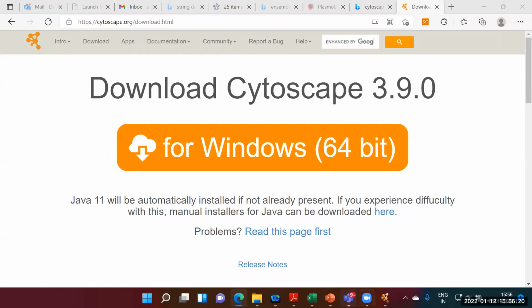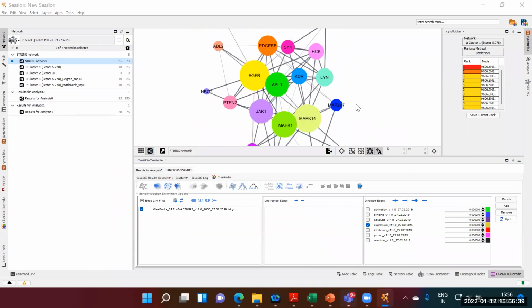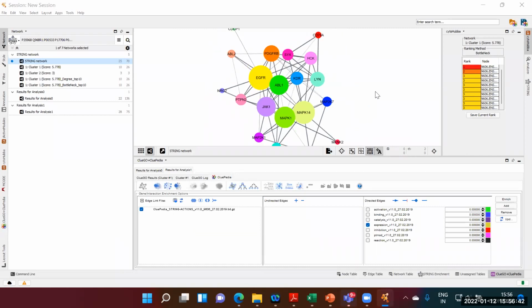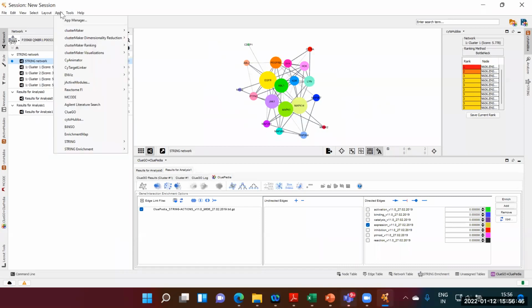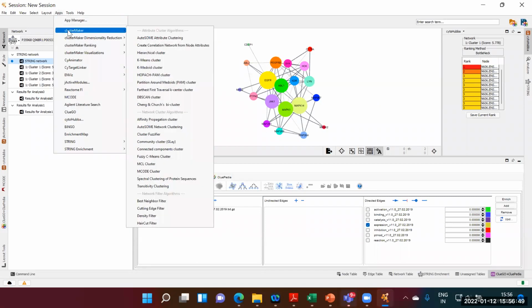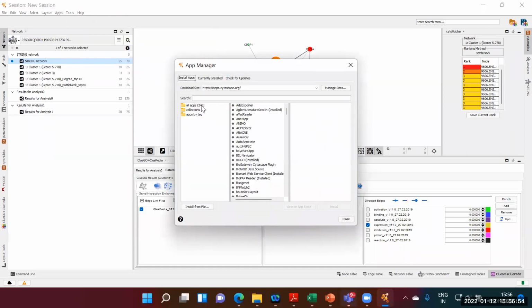Have you understood anything? And again, I wish to say there are a lot of functions in this. There are a couple of apps available for biological analysis, which is shown here. But if you see in the app, you can see that there are 243 apps.